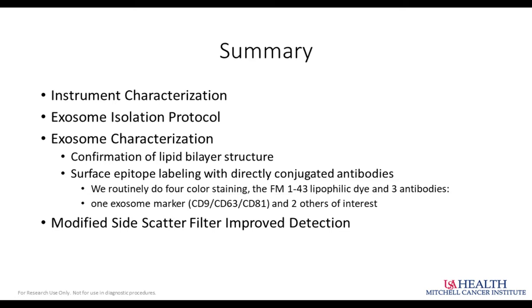Thank you. Next one is, how were your samples collected, and were there any time restrictions? So for working with culture supernatant, it's not that difficult. You do have to start with much larger volumes to get the number of exosomes back. So on average, we would do all 6 places in the ultracentrifuge rotor with 50 milliliter tubes. So we would try to spin at least 300 milliliters of culture supernatant to start with.